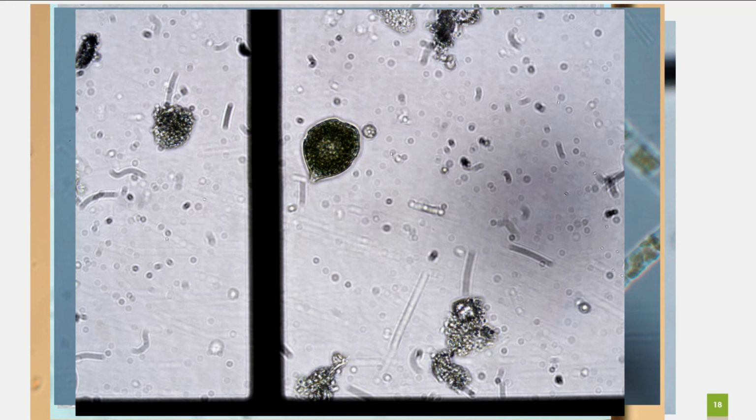Now, Maine used to do that, but their volume of testing is huge. And they've moved away from mouse bioassay, and they're doing HPLC. So in that, you can actually see what the different flavors of saxitoxin are. Yeah. We are now moving in that direction for New Hampshire because the new lab staff are just mortified that they're doing it. And we actually bought an HPLC machine with red tide disaster relief funds 10 years ago.